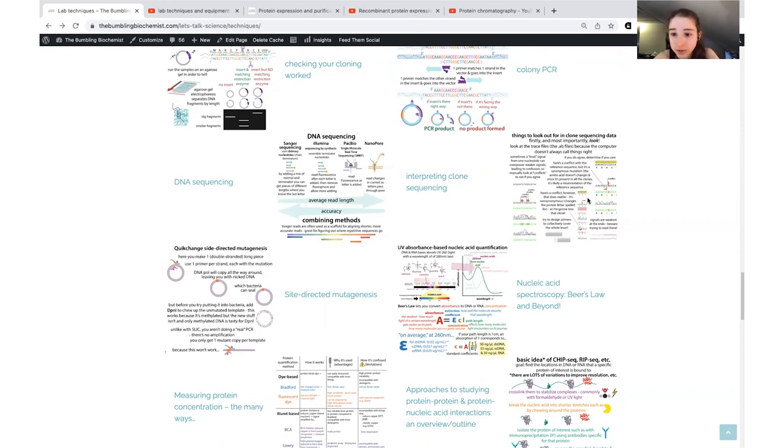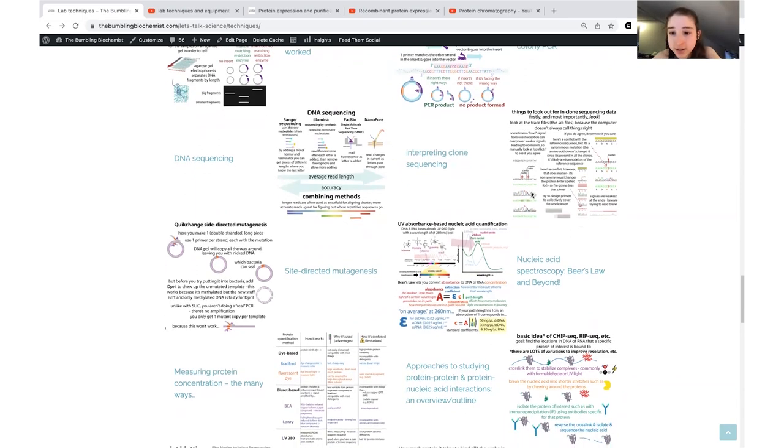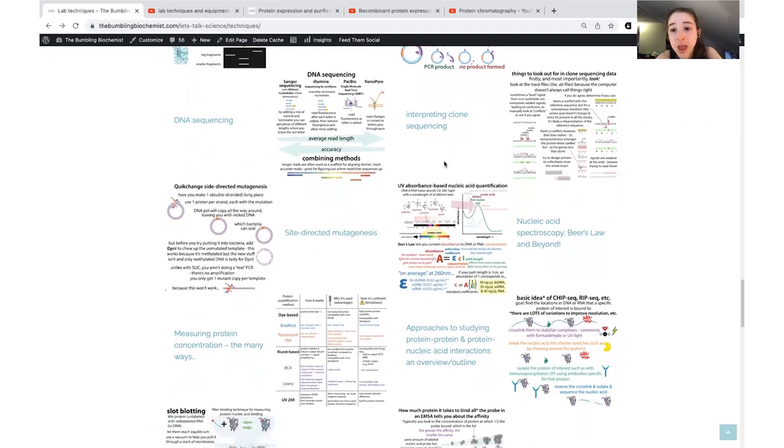And the places to really watch out for are the ends, and also look at the places where you put the gene in. I shouldn't use the terminology like splice sites, but the places where your gene meets the insert and where you were making the changes. The ends of the traces are gonna be more noisy though, so don't trust the things at the very end. So it's important to look at these trace files, and you can look more in this post for more.